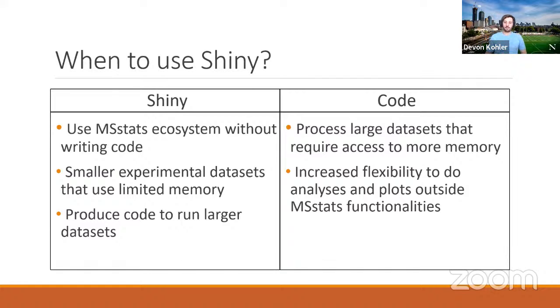It's really good, even if you did download it locally, it still is better for experimental data sets that use limited memory. So the app itself, just because it's a UI application and not code, generally takes up some RAM on itself before you even start processing the data set. So it does require you to have an overhead of RAM to begin with. And so it really does work better for smaller experiments that aren't going to take up all the memory on your computer.